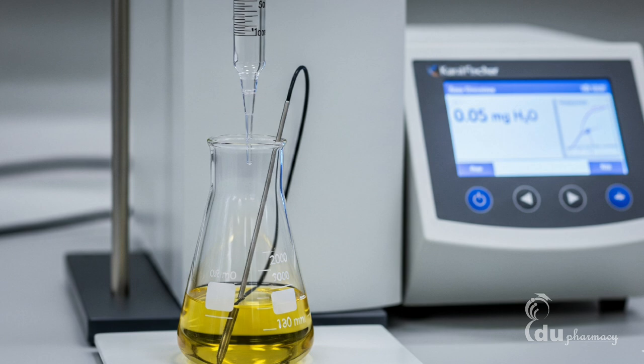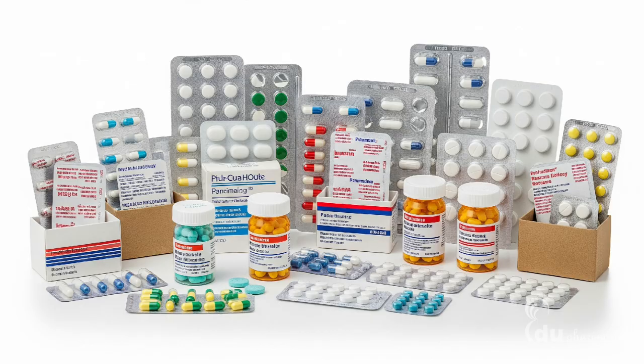Understanding how much moisture a powder can absorb helps in selecting the right packaging, whether it's blister packs, HDPE bottles, or containers with desiccants. So, where does all of this matter in the real world? Let's look at some applications.